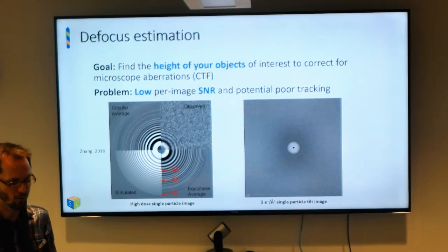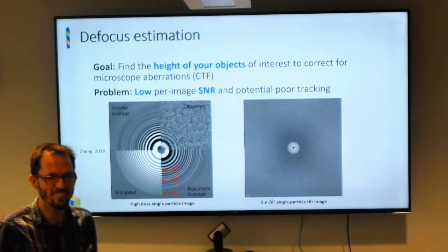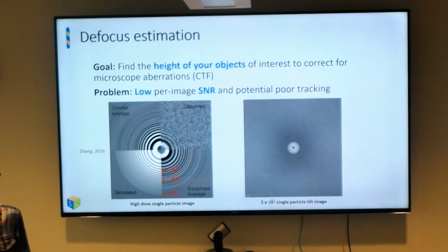That's what I argue whenever anybody asks this. I really ask, again, it's a roundabout way of asking, why would anybody use fiducials at all if Protomo exists? Because I still see people using fiducials all the time. It's faster. So at least right now, it's faster. Protomo is currently CPU, though there's people working on GPU.